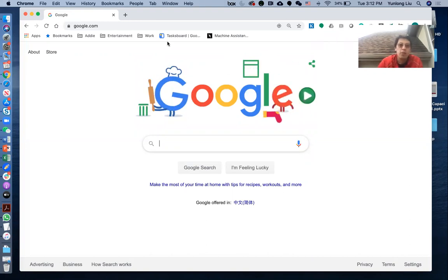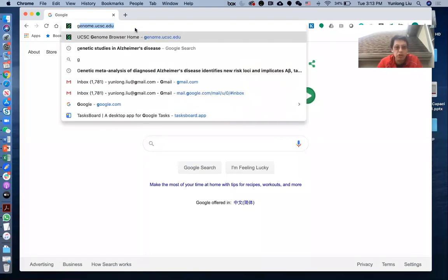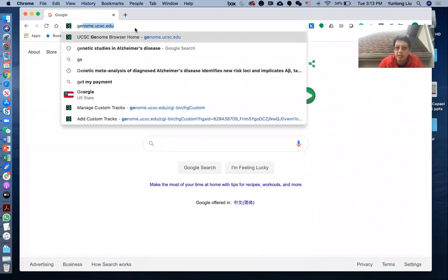So we will first go to the UCSC Genome Browser website, which is genome.ucsc.edu.